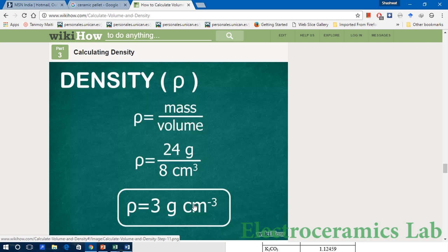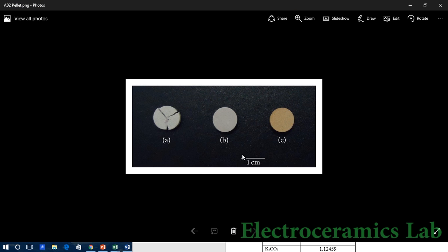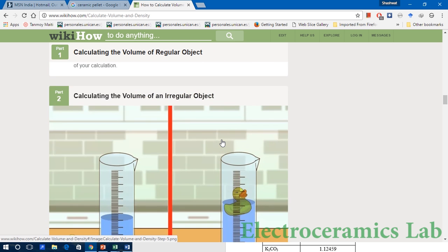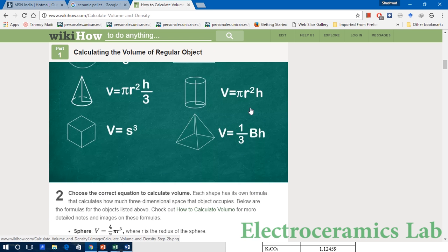Here we are showing a practical approach to calculate the geometric density using a cylindrical pellet of a ceramic material. This typical cylindrical pellet has a certain diameter and a certain thickness. The diameter and thickness can be measured by vernier calipers and screw gauge respectively. The volume of a cylinder is given by the well-known formula: V equals pi r squared h.